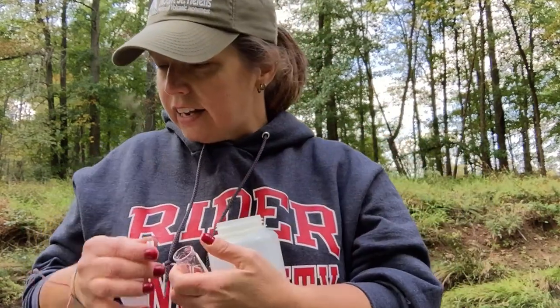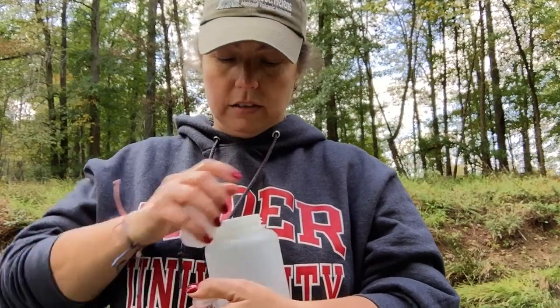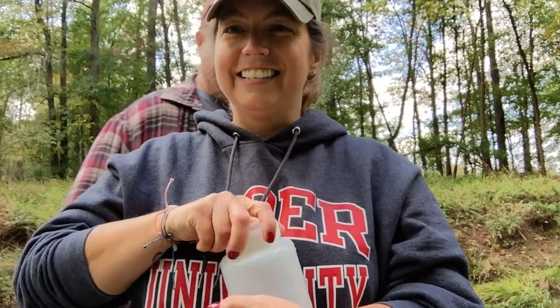Next is total dissolved solids. That's not a chemistry test like this, but it's another device that we use to measure something in the water.